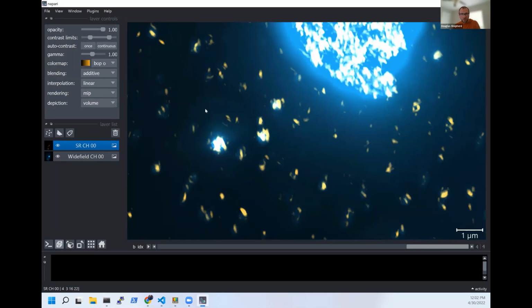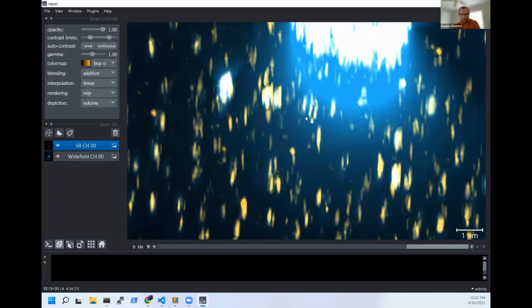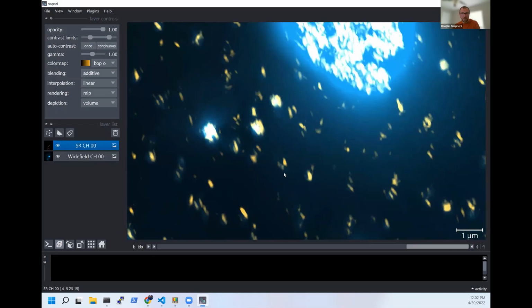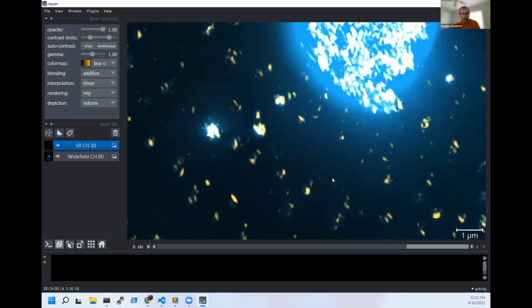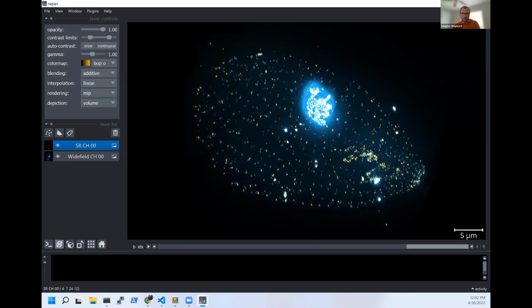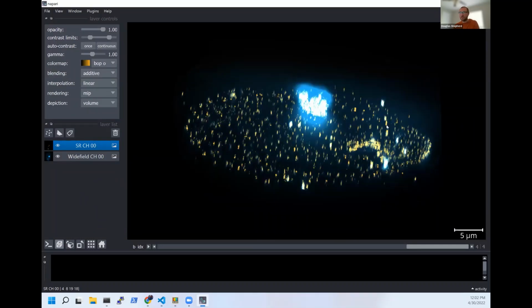So if we clip the background just a little bit for the purposes of display in 3D, you can see the parameter guesses we had are starting to really narrow up some of these puncta in 3D. And so with a bit more optimization, you would be able to get to the reconstruction quality that Peter showed in the talk, because this is the exact same data set that he showed.